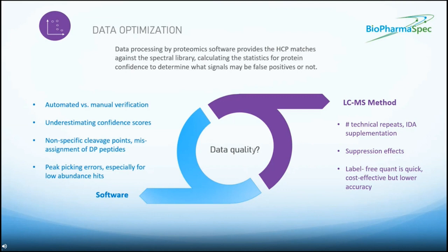So further manual or human scrutiny of any HCPs can have a significant impact on the total estimations at the very end, and we think it's very valuable. So as I said, data quality is also dictated by the LC-MS strategy, and I'll just go through a couple of points.